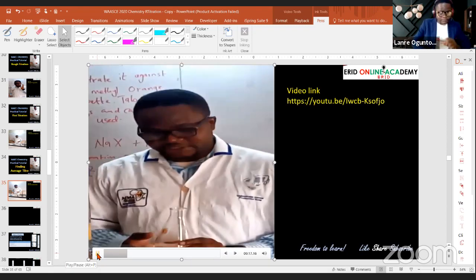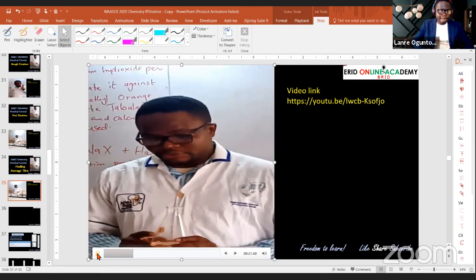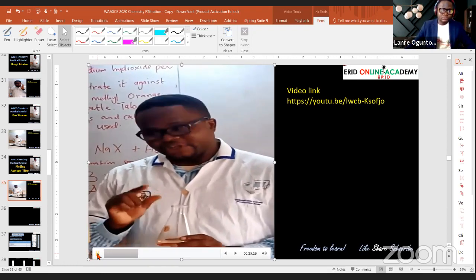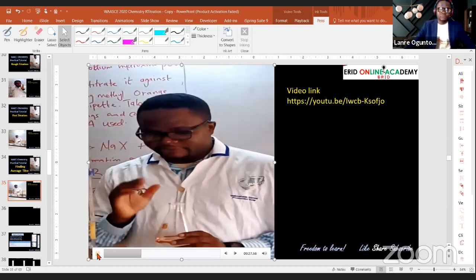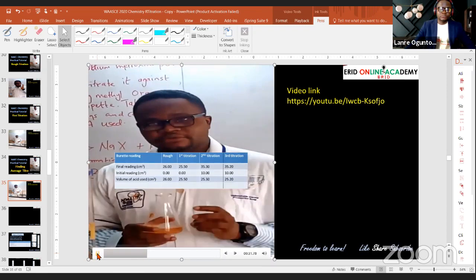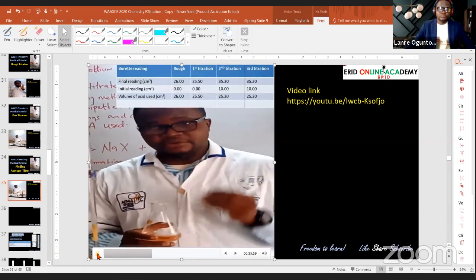Now to calculate the volume of acid used, which you are going to use for your final calculation, you are going to find the average of the titer. If you check your record, as you can see on the screen, you have your rough value, the first titer, the second titer, and the third titer.